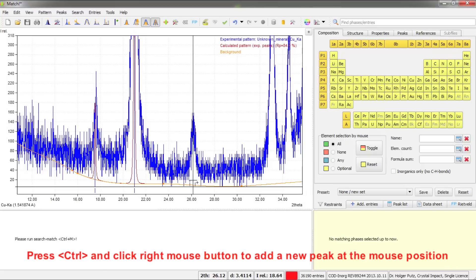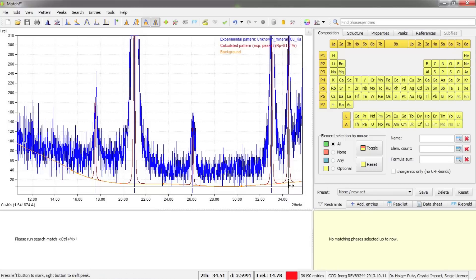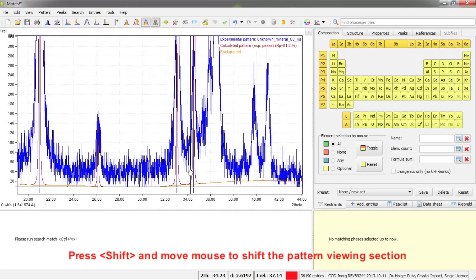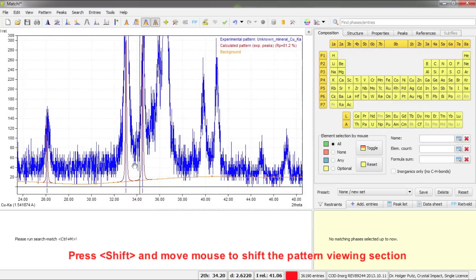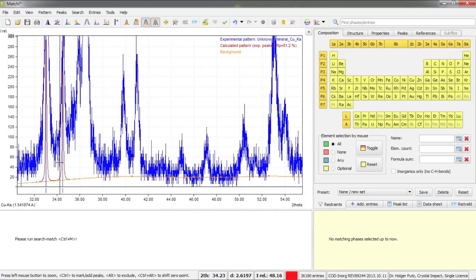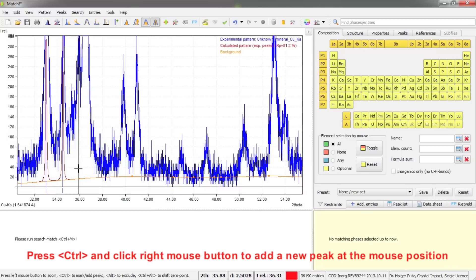I'll continue adding peaks at each position. When I need to move to parts of the pattern not currently visible, I press the Shift key — the mouse cursor changes — and move the mouse to pan the diffraction pattern to the left. Then I release Shift and continue adding peaks by pressing Control and clicking the right mouse button.